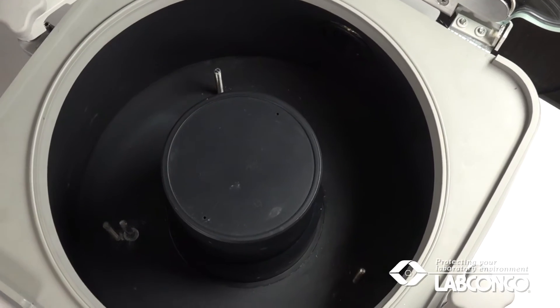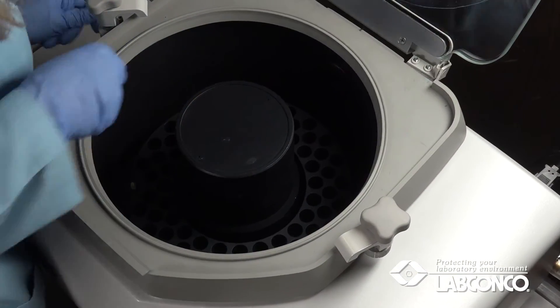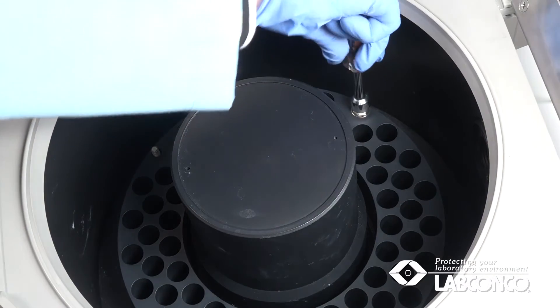Position the block over the three studs in the chamber. Install the flat washers and hex nuts. Tighten securely.